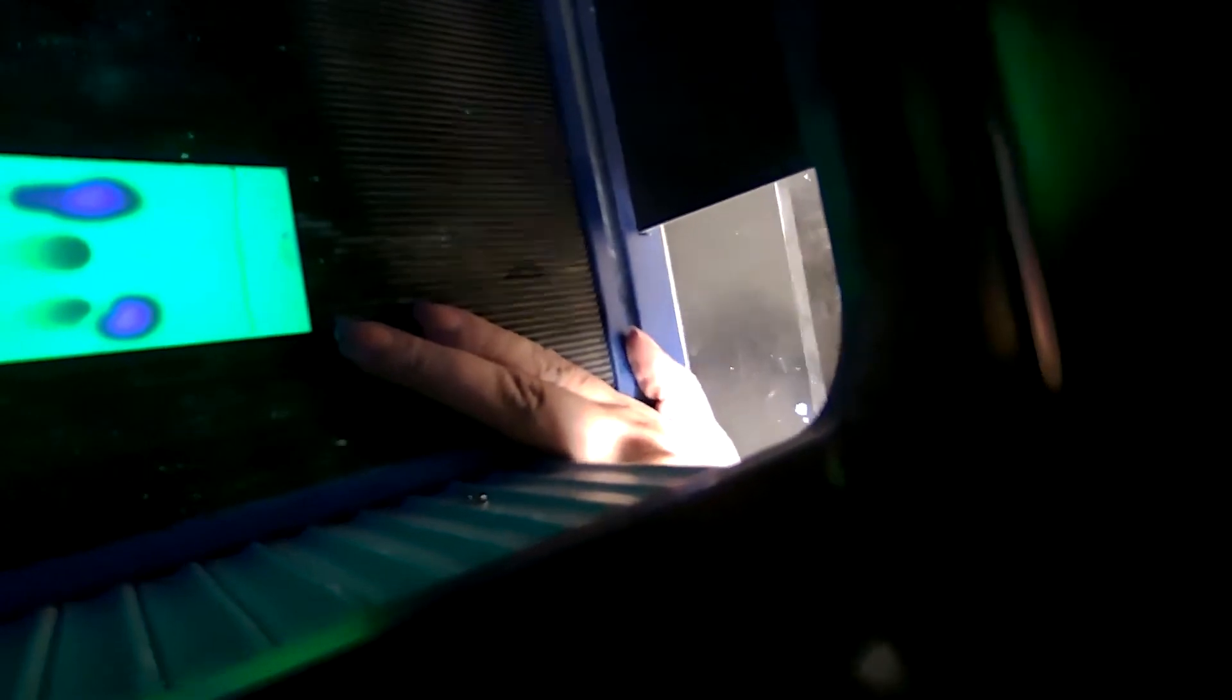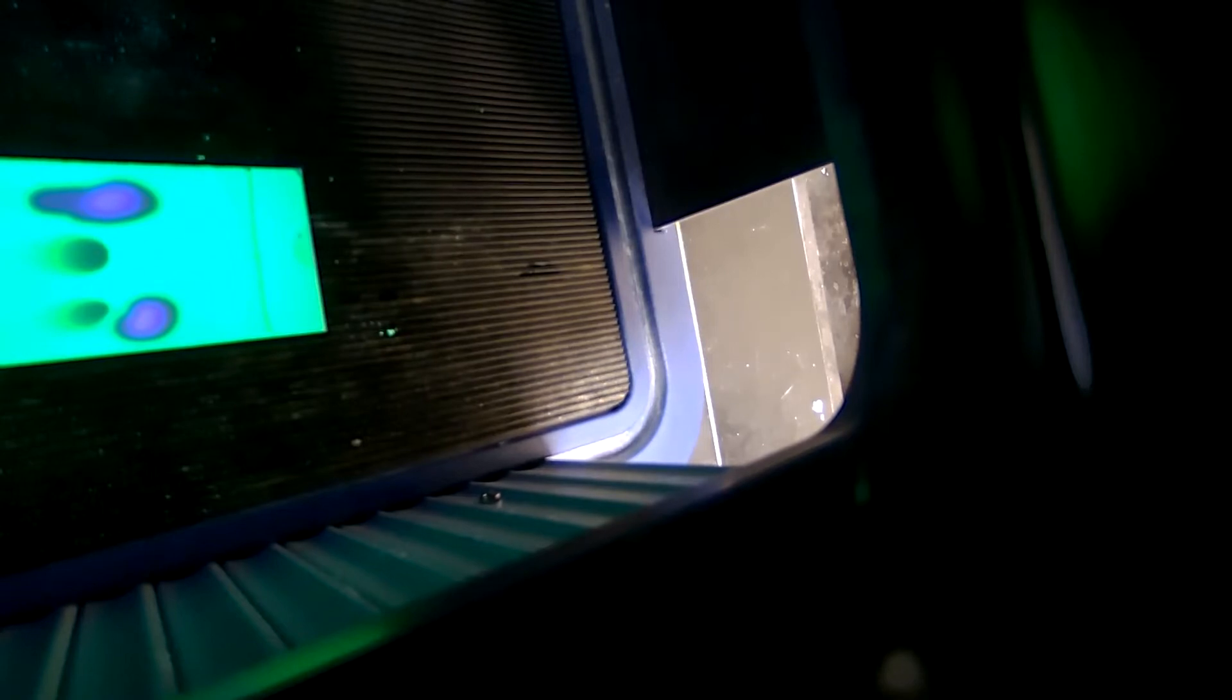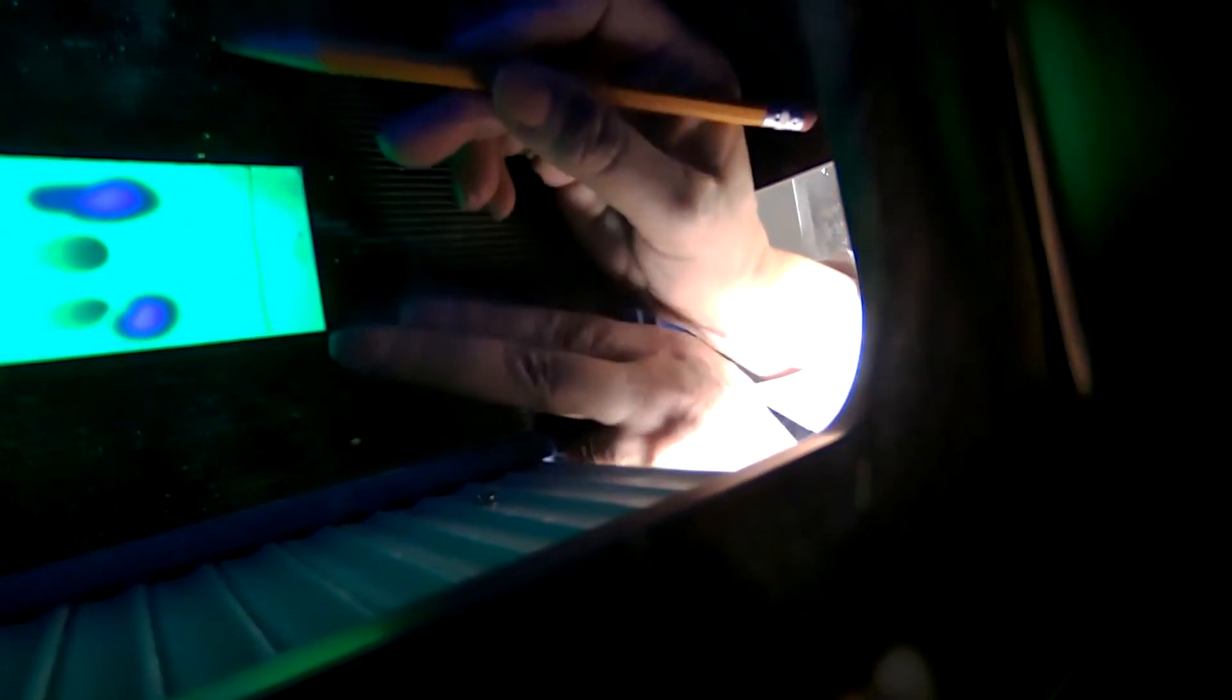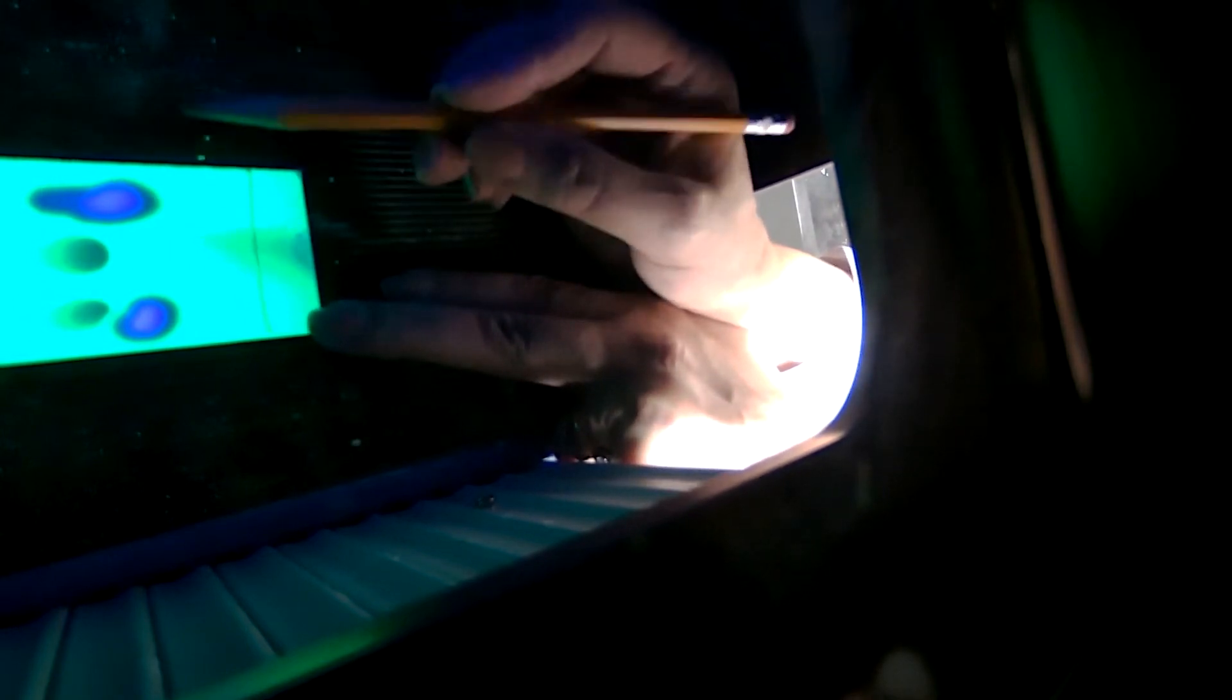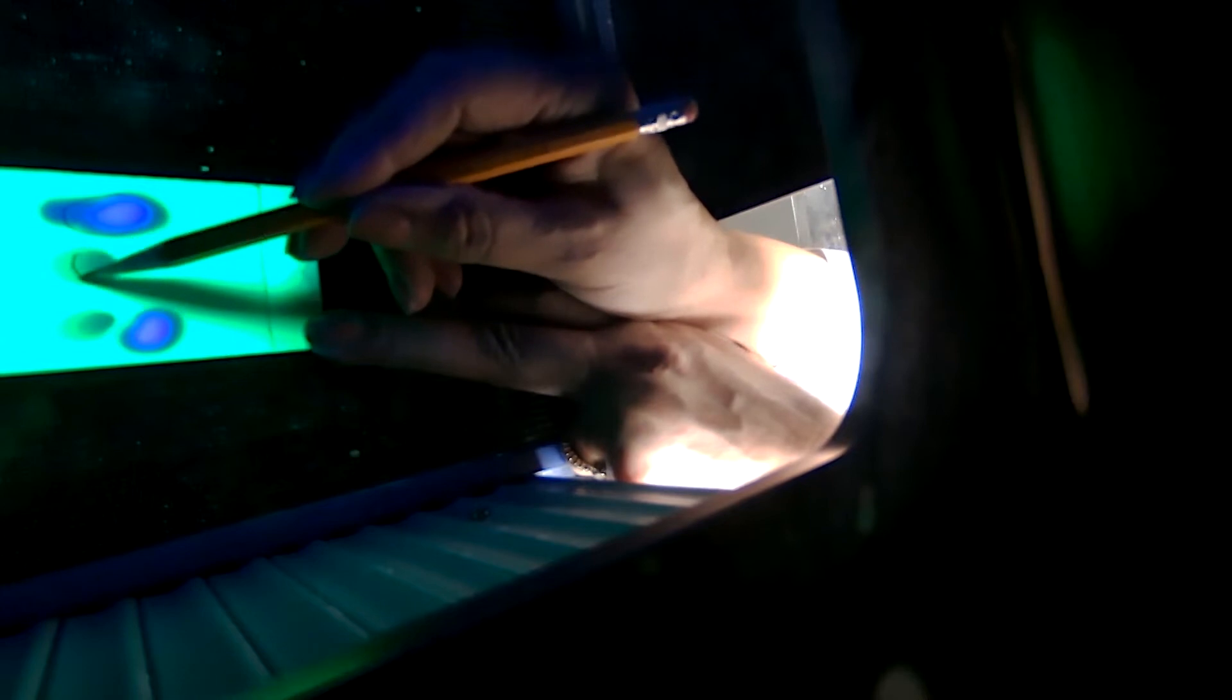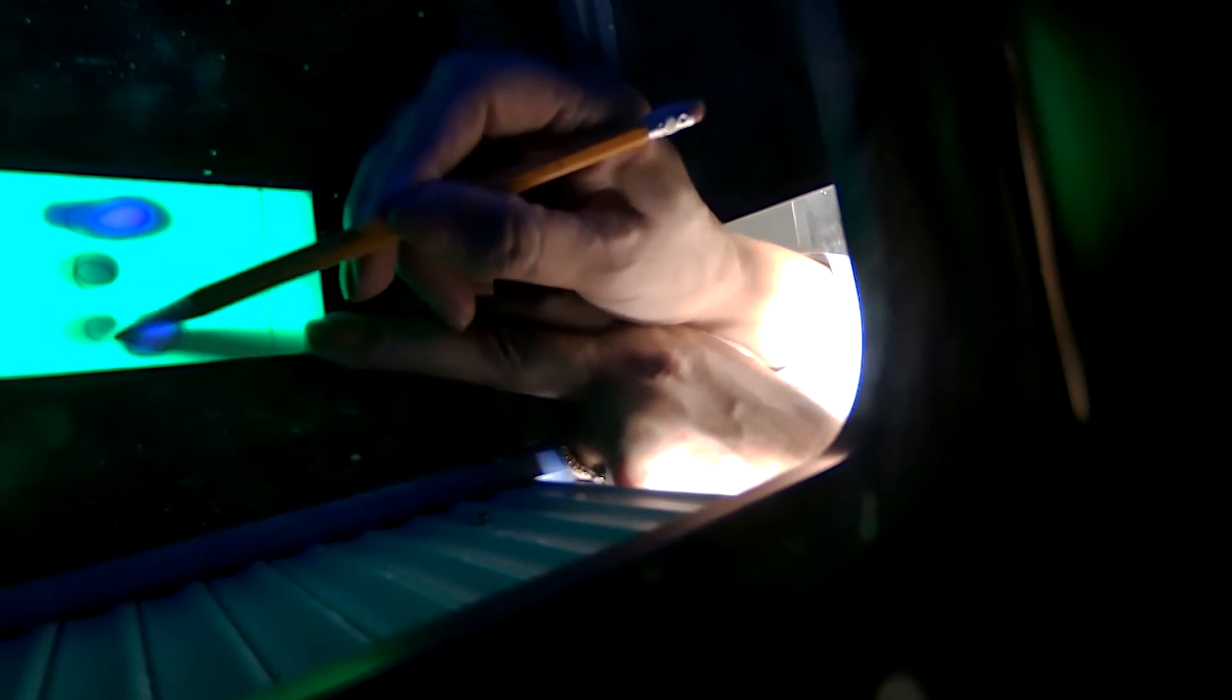We are watching the TLC plate under the UV lamp. It's nice that we have also different colors. I see a different color for the neutral from the acid. That has to do with the number of pi bonds the neutral compound has. But that's something you can include in your lab report. I'm going to circle the spots as it appears. But I just want to mention that for this part of the experiment, we are not concerned about the RF. We already know what the compounds are.